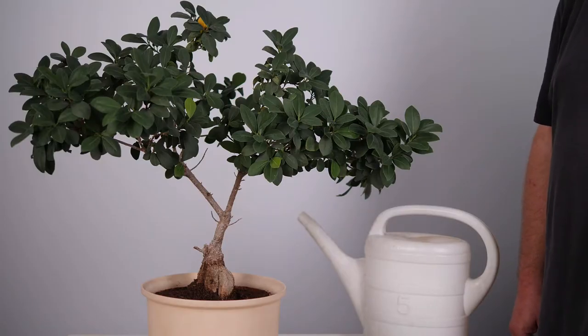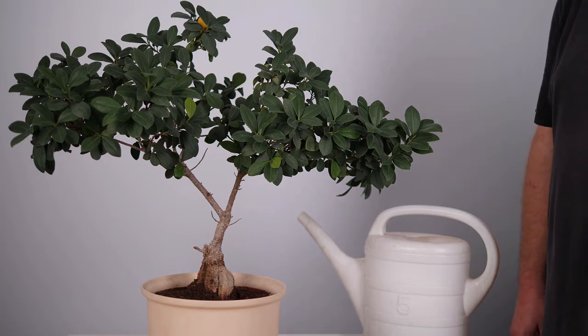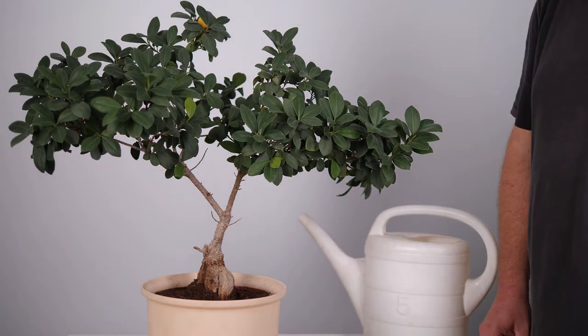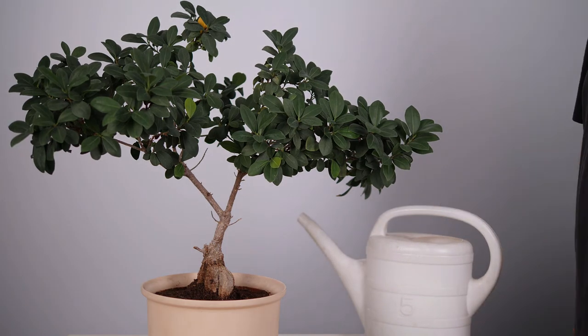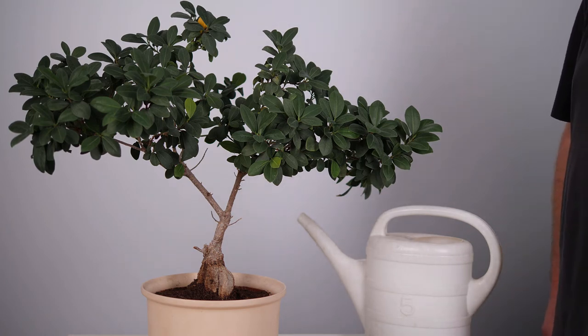Now that we know how TDR measurements work in theory, we want to do a little experiment. We have a handheld TDR device, a plant, and water, and I will measure the soil moisture content using this TDR device. Then we add some water and measure again.